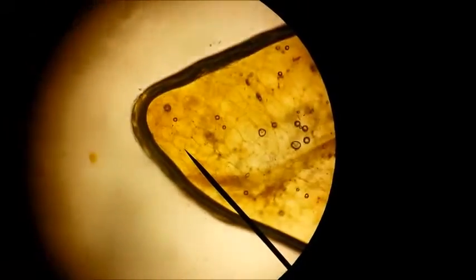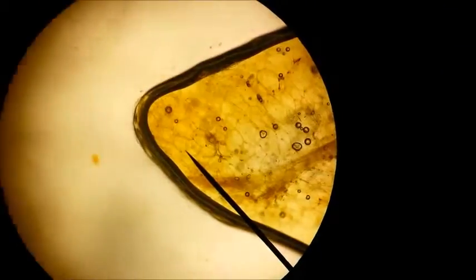This is on 40x magnification and this group used iodine stain. Here you can look and see a pretty nice nucleus right at the end of the pointer, or close thereabouts, and a nice honeycomb look. This is the pith of the onion.